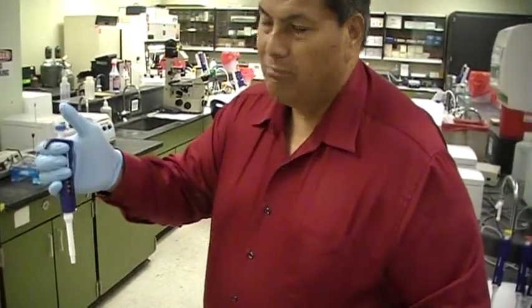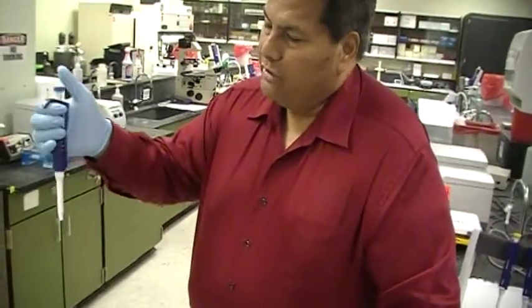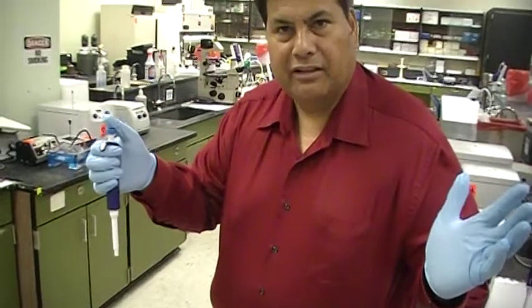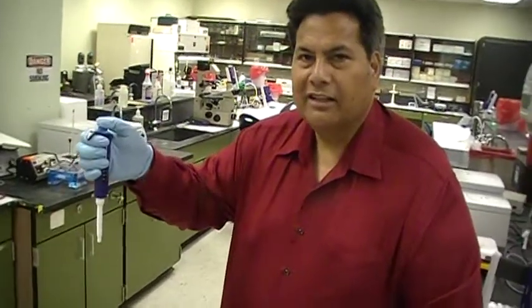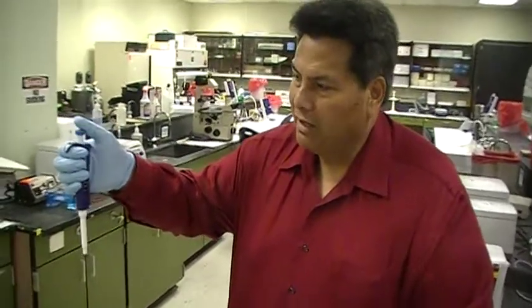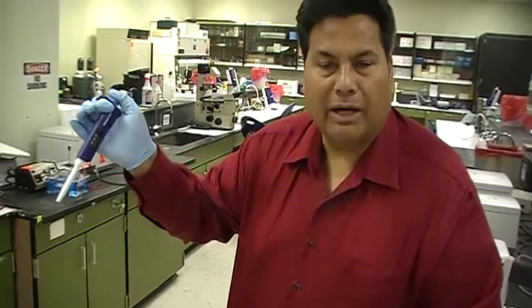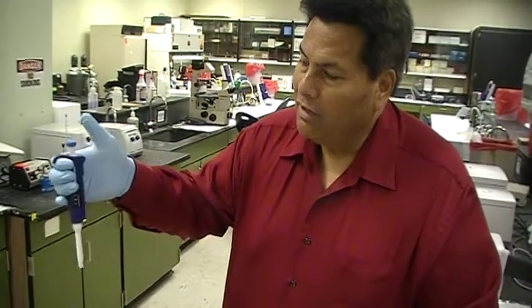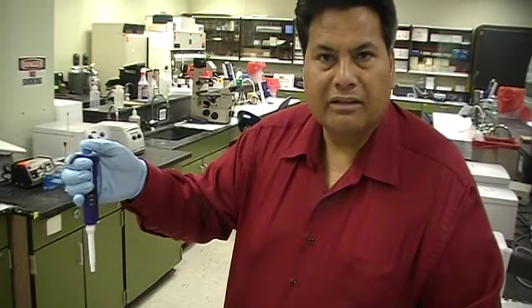Now I'm going to show you the most important aspect of pipetting. When you hold it and push down very slightly, it stops. But if you force it, it goes past that stop. It's just like a traffic sign — at 3 o'clock in the morning you come to a stop sign, it means stop. If I press this knob slightly down and come to that stop, that's exactly 780 microliters. But if I go past that stop, that's more than 780 microliters, and that's not very accurate. So to pipette, come to the first stop, and that's it.